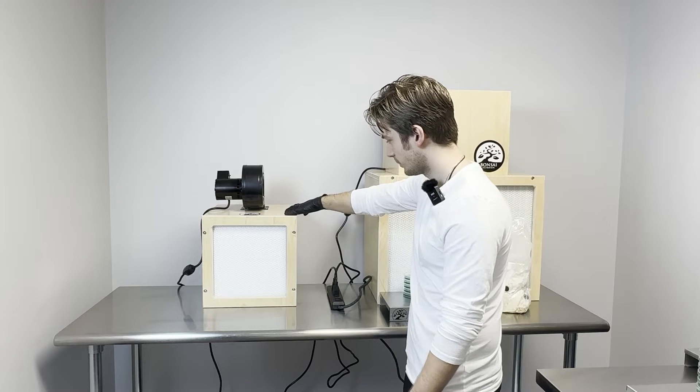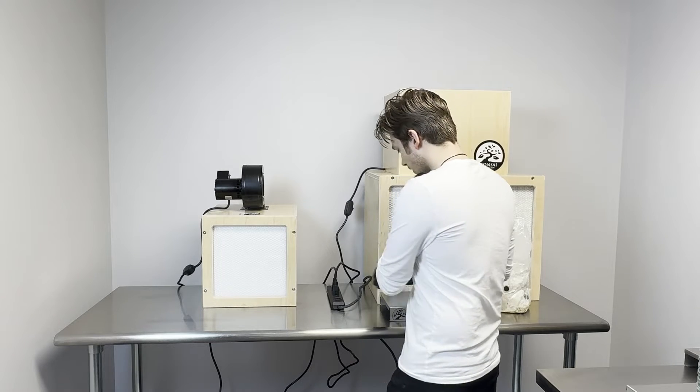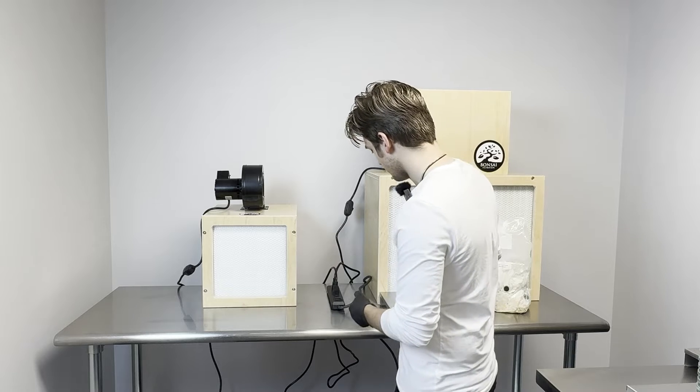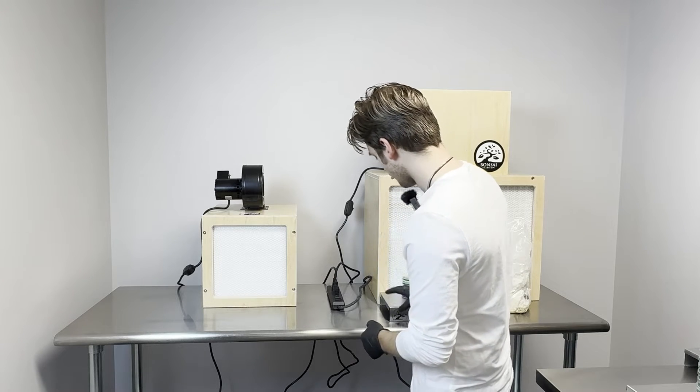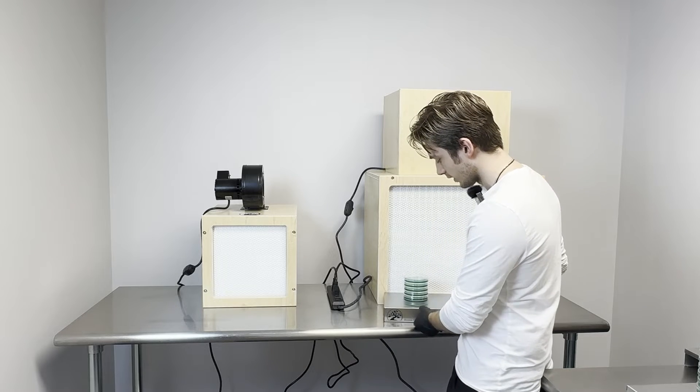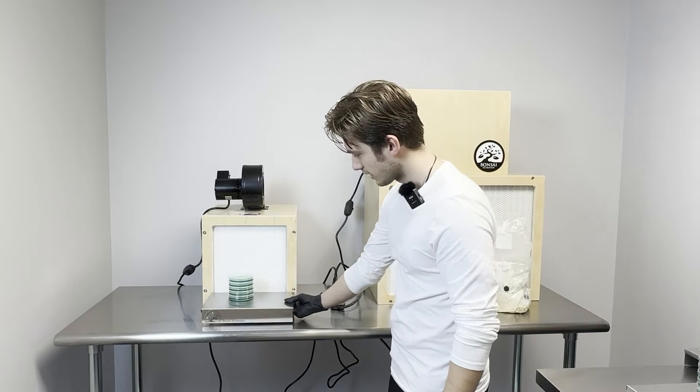This particular flow hood model is great for doing agar work, liquid culture, or working with spore syringes. If you are going to do any type of work with agar, we definitely recommend using one of Bonsai's risers. It's definitely very useful for that particular use.